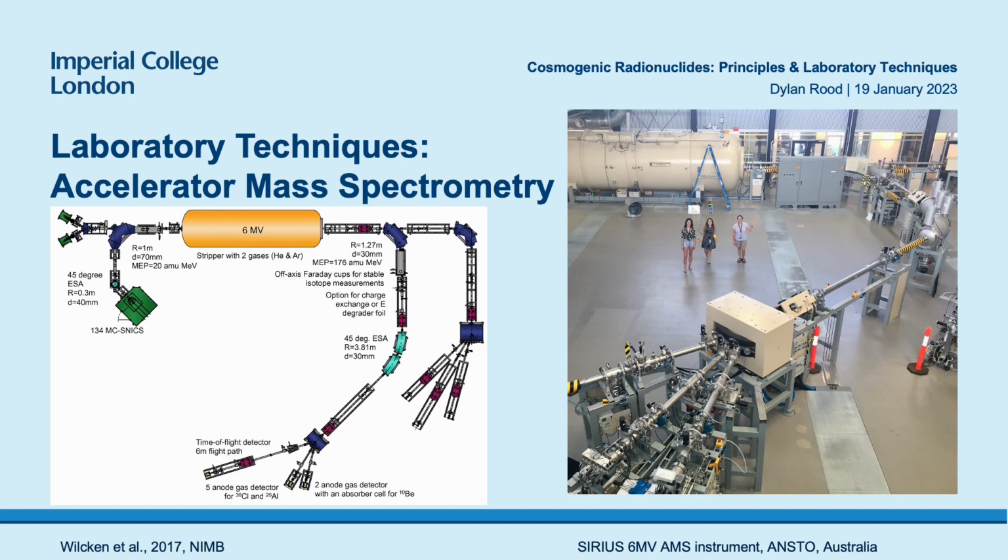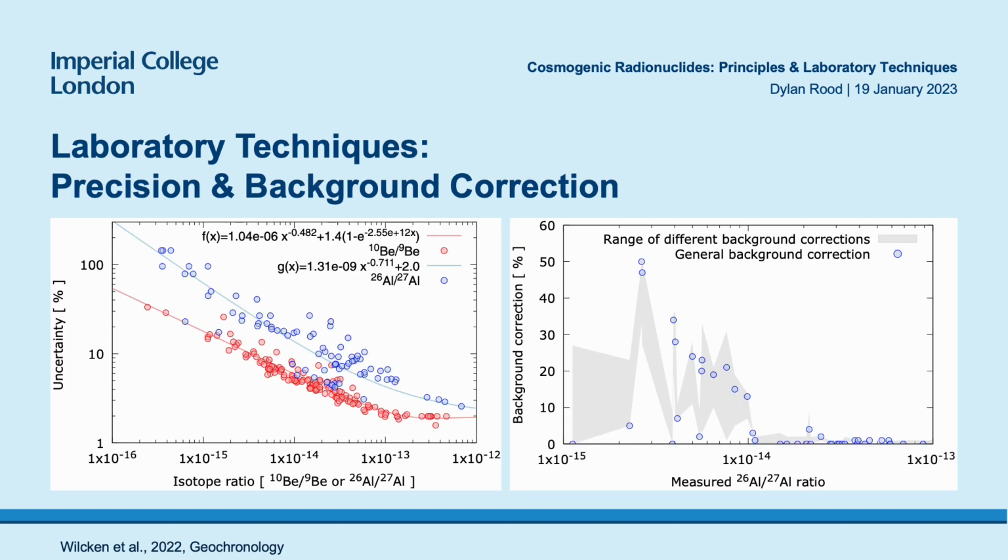The advantage of this, to cut to the chase, is that you can measure 1 in a million billion atoms. That's like 8 orders of magnitude more sensitive than any other mass spectrometer. And we're looking at coastal samples. If the blanks are 1 in a million billion, we're seeing maybe 5 out of a million billion in the samples. So we're very close to the backgrounds, and so all of these chemistry methods really matter to get the best possible analyses out of the accelerator.